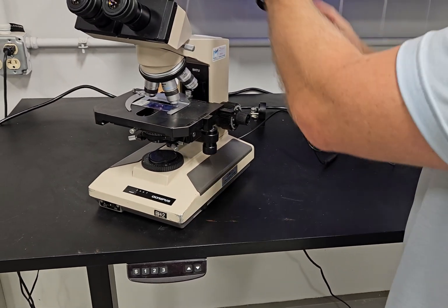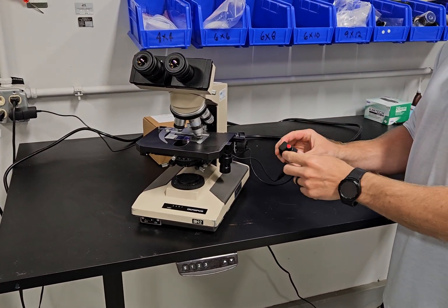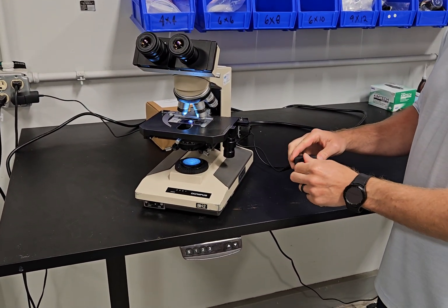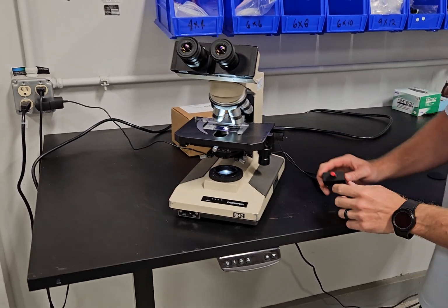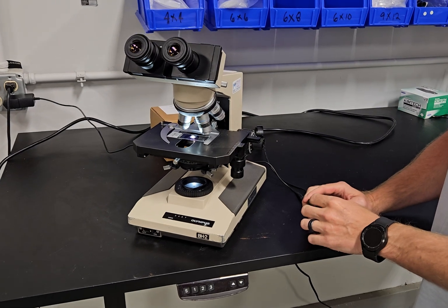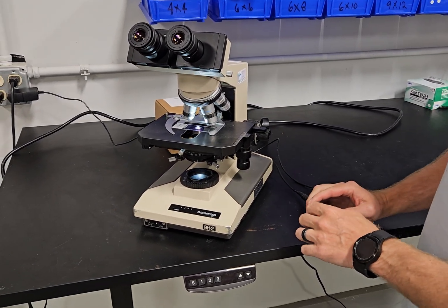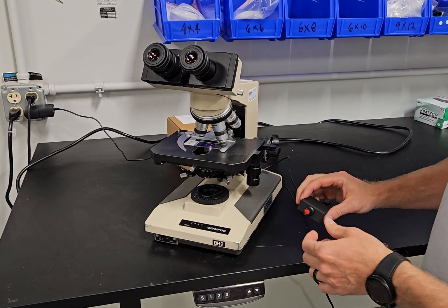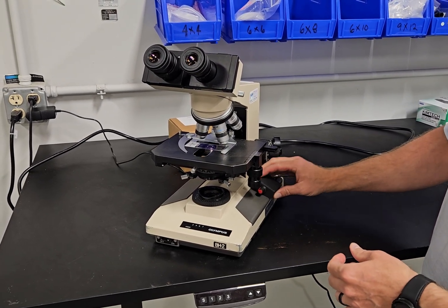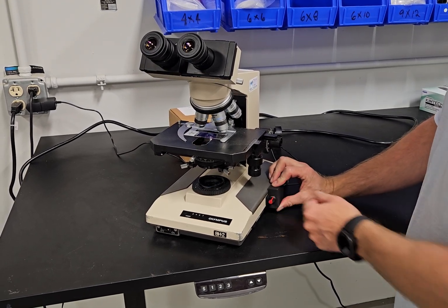We're going to plug this into the wall. There'll be a piece of double-sided tape in the box and you can mount this wherever you'd like. You no longer will have need for the blue filter, so you can disregard that. This is a nice, super bright white light and the potentiometer works great. It has a click — you can hear it for on and off. You can mount it anywhere you like; most folks are going to mount it here or here with the double-sided tape, and your BH2 is like new.